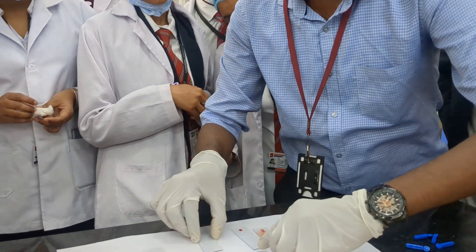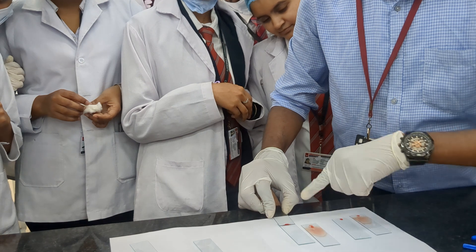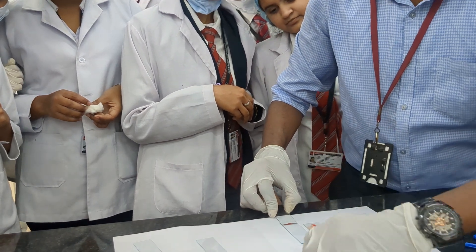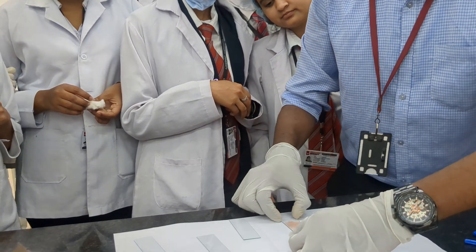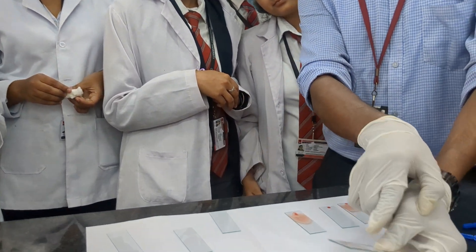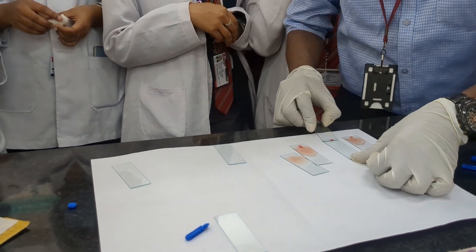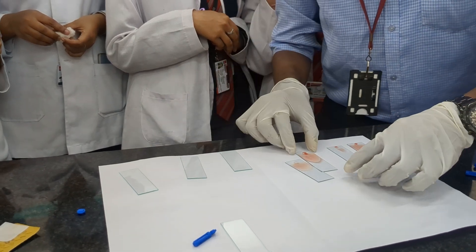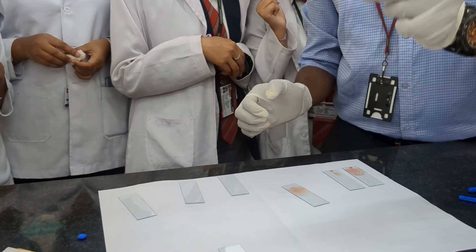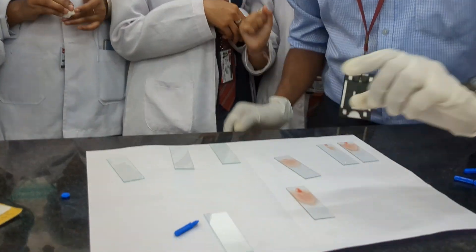We will perform again with another blood sample. Let it spread evenly. Now the blood has already clotted — I don't know whether we will get it or not, but we will see. Since the blood is clotted, we got some squeezes at the end. You need to perform it as fast as you can. We got two samples; a proper tongue smear came in this sample.